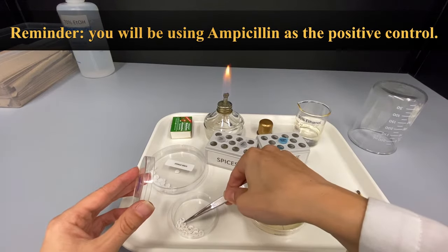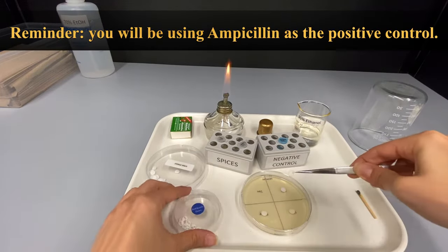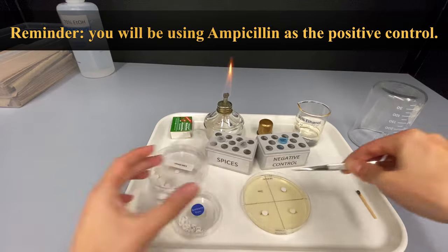For the positive control, pick up the streptomycin disc and place it in the center of the streptomycin section.